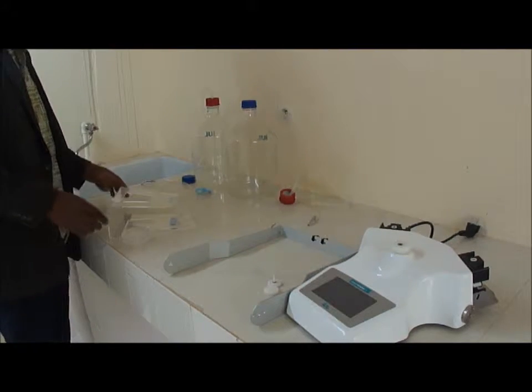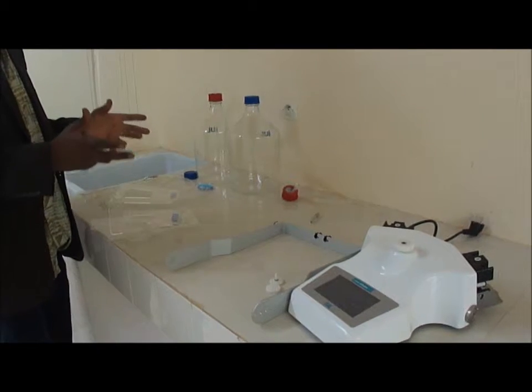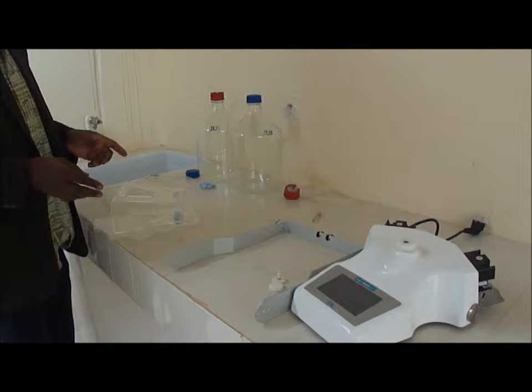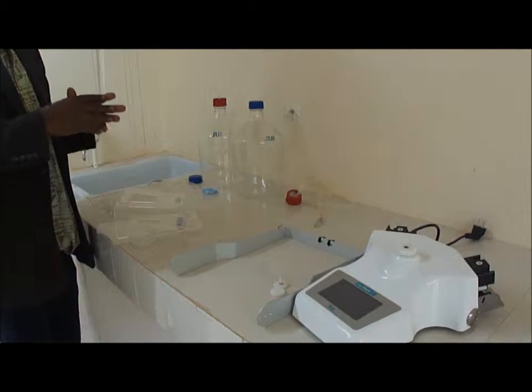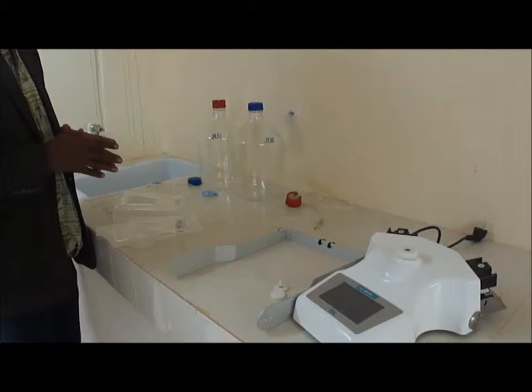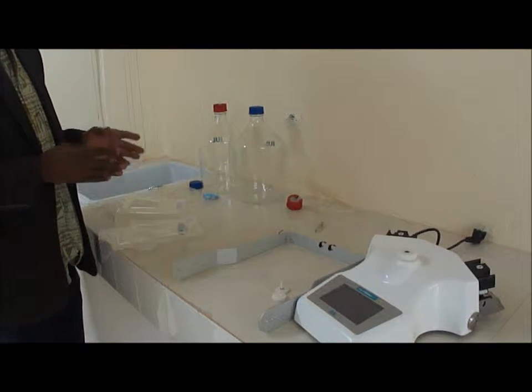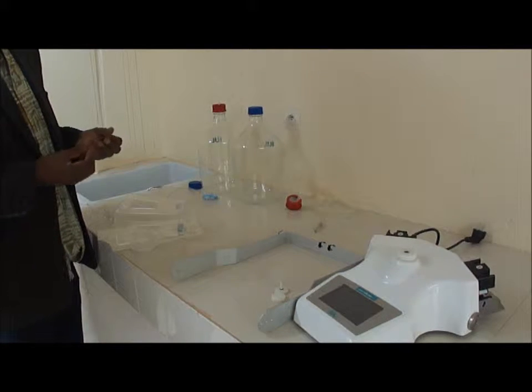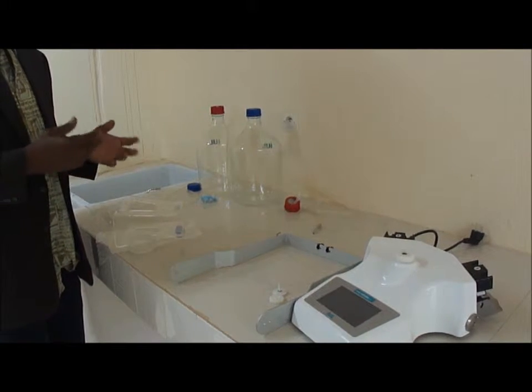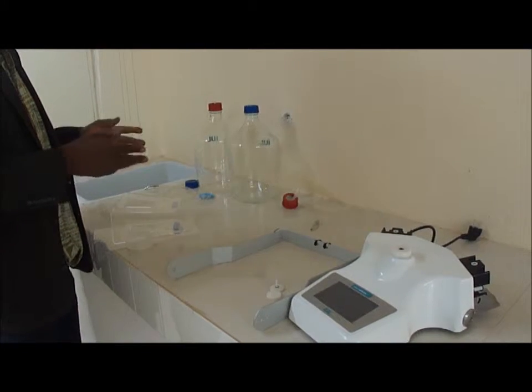Okay. Here we want to make a contribution on how to mount the system called smart diluter, and that is used a lot in microbiology, but also in chemistry when you want to make multiple dilutions. You have a lot of dilutions to make using a sample which has a concentration, for example, of bacteria very high at the beginning, and you want to obtain a dilution that will allow you to make your numbering, either by the most probable number or by using the agar plates.